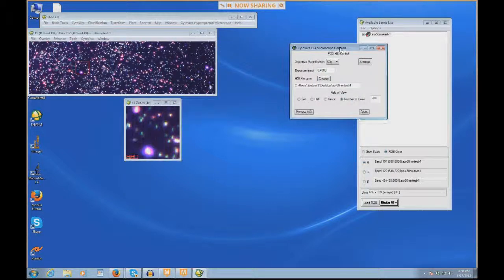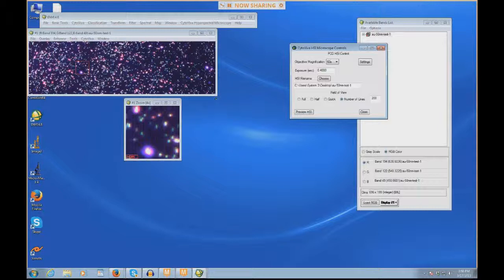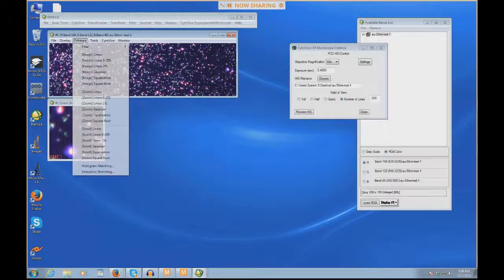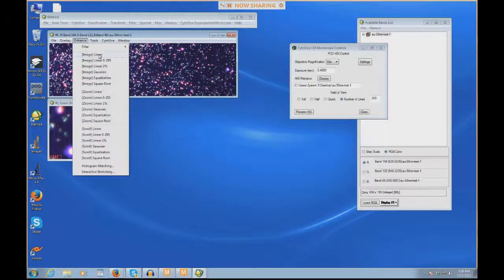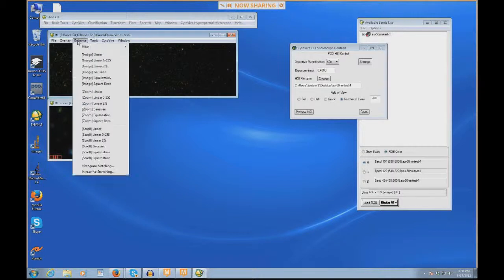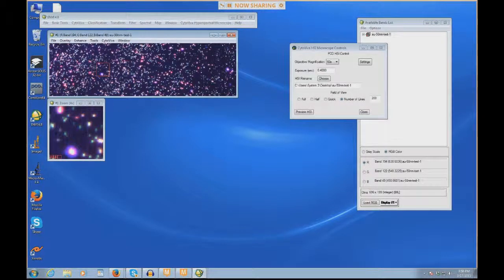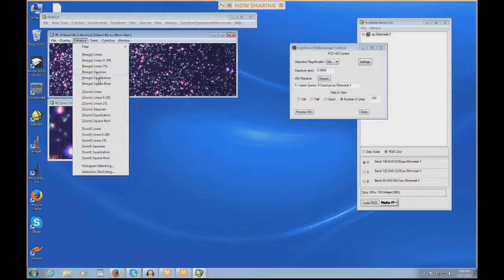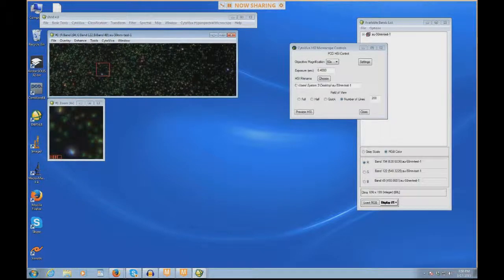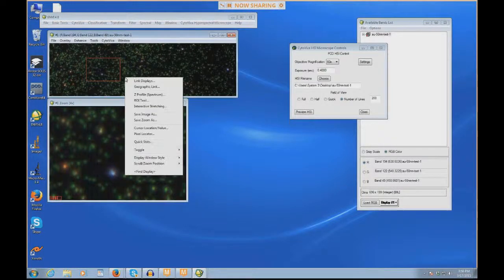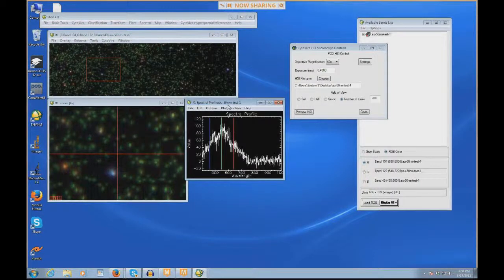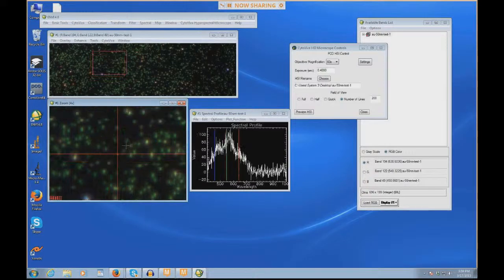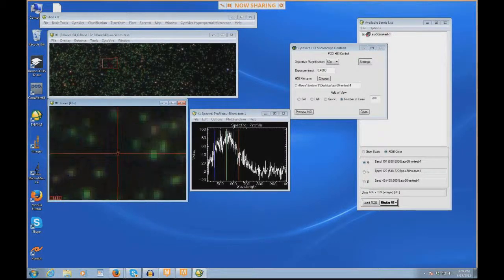I'm going to show you a couple of quick things about Envy. There's going to be other webinars posted describing some Envy basics and some other tools. Just to kind of give you an idea of what we're looking at, we can go to what's called the Enhance feature. The Enhance feature basically shows the data in different ways. This is a linear data view. We have 0 to 255, which is more of like an 8-bit image. It defaults to linear 2%, so this is what it looked like when it opened. There's a couple of other ones, Gaussian and equalization, and then there's also square root. In this case, I think square root kind of looks more like it looks in the microscope.